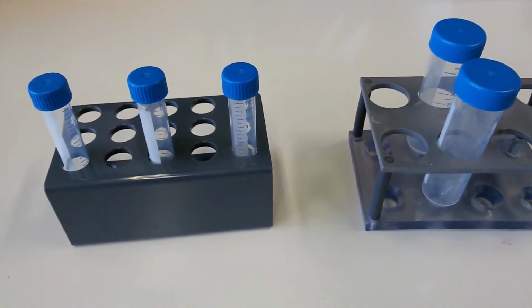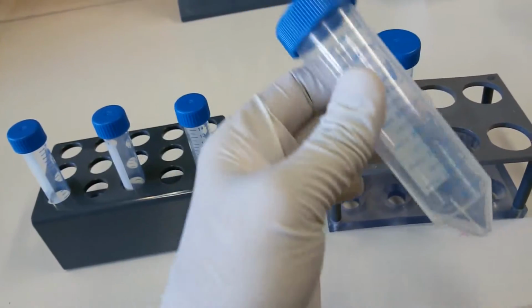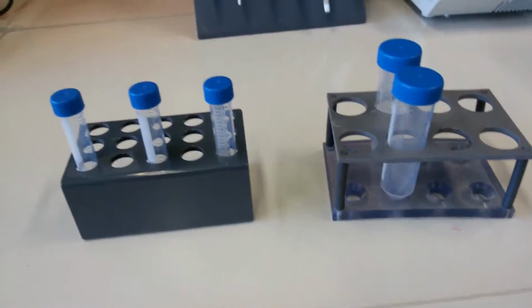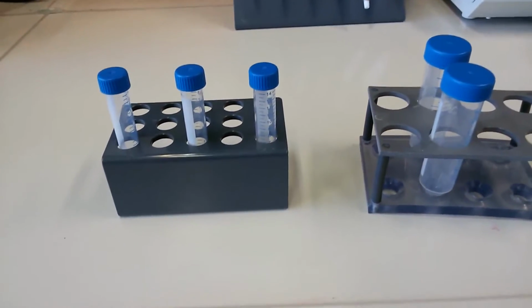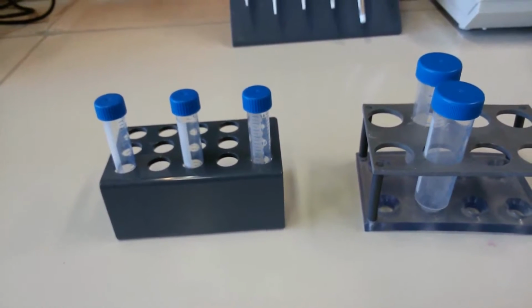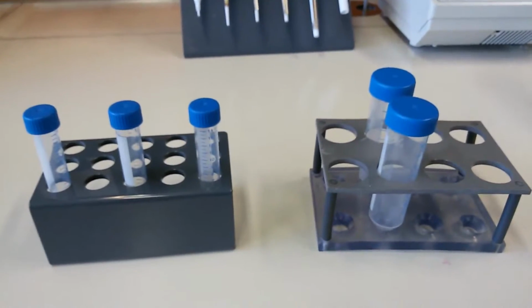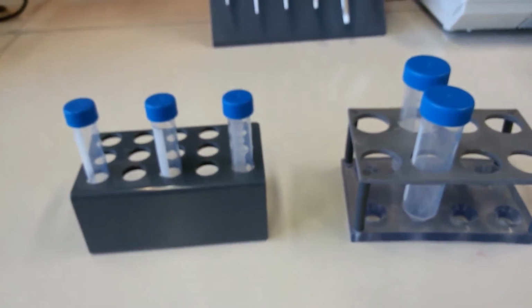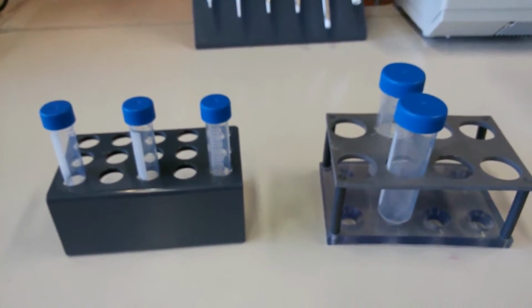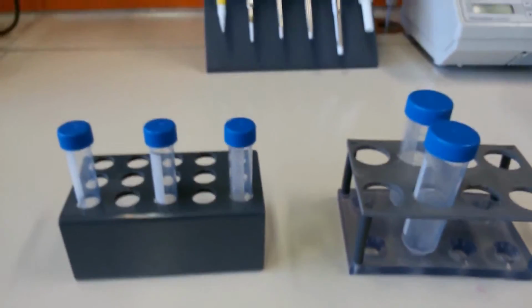At that time, you don't prefer the 50 ml or 100 ml Scott bottles. You rather like to have these plastic tubes, which are more handy, so you use them and you throw them. Just a short reminder: the rest of the things that I showed you before, you cannot just use and throw. You use them, you wash them, you make them sterile using an autoclave, then you reuse them. With these tubes, it generally depends on the lab. Some labs prefer to reuse them, and they are autoclavable, but in my lab and for most people, they don't prefer to reuse them, so they use and throw. Great.